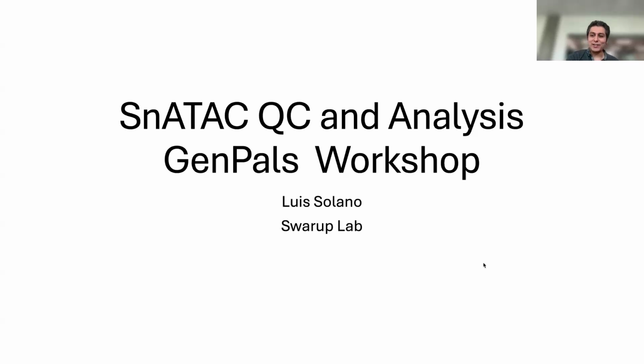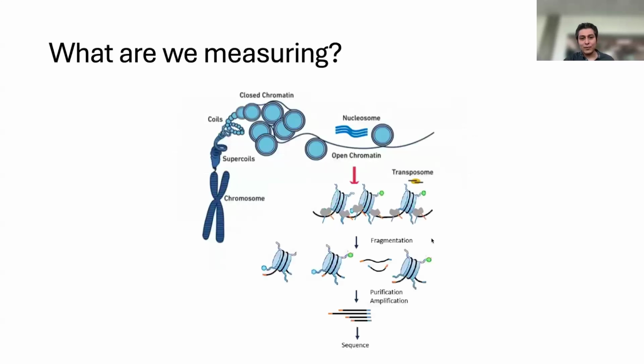It's going to be more of a demo and showing off some of the functions and some of the plotting that you can do with these tools. So not quite a hands-on bit, but you're welcome to reach out to me. We'll talk offline about how to set up the environment, and I'm happy to maybe share a notebook or some of the resources used to generate these. Anyway, jumping into things.